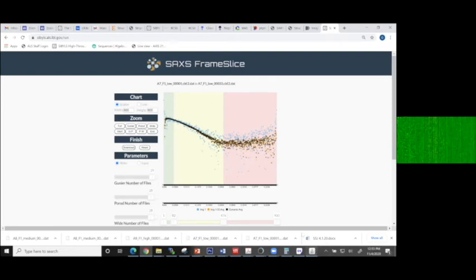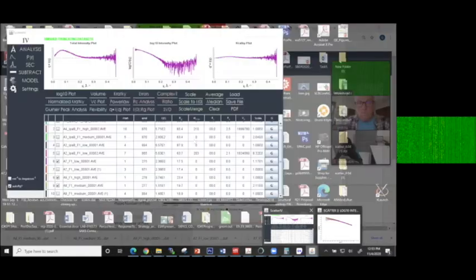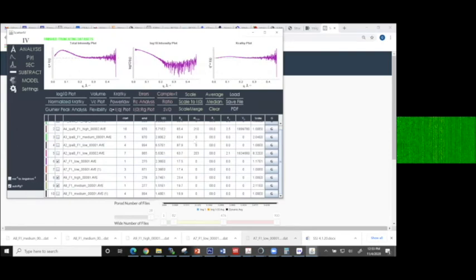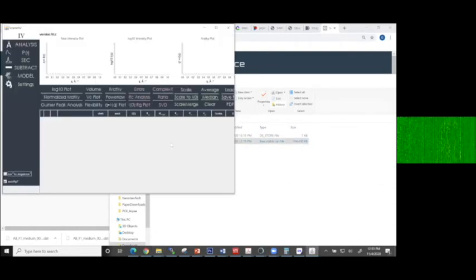And scatter, well, let me just open it fresh. So of course, I just downloaded the most recent version, so it's in my downloads file, super well organized. Again, we are scatter devotees mostly, because scatter did start at SIBYLS.